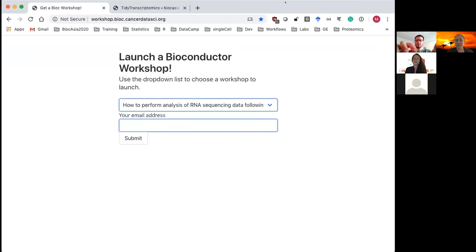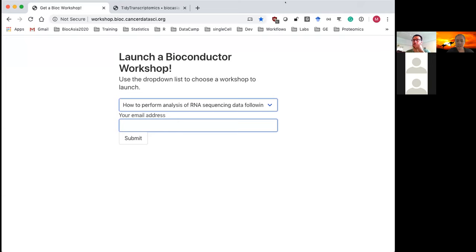After submitting, you'll see a screen with a username 'rstudio' and a password. This will launch your own RStudio session in the cloud — each person gets their own unique URL. Please don't copy anyone else's URL because you'll kick them out of their session. This cloud setup will be available for the next eight hours.